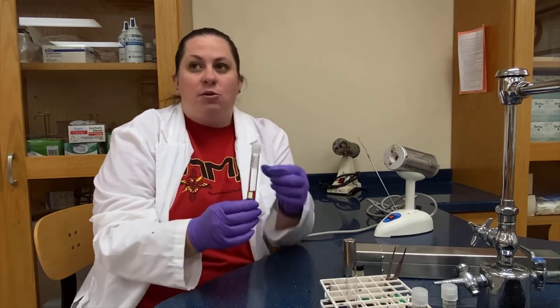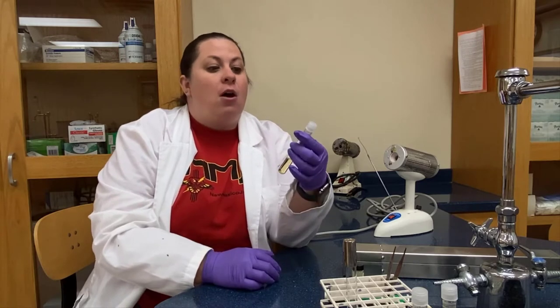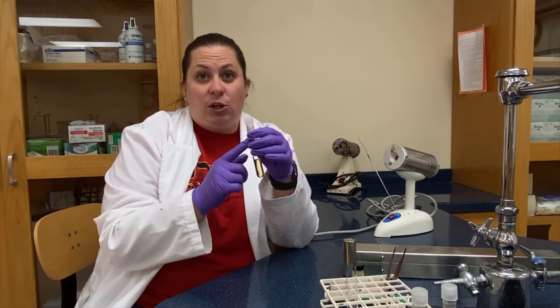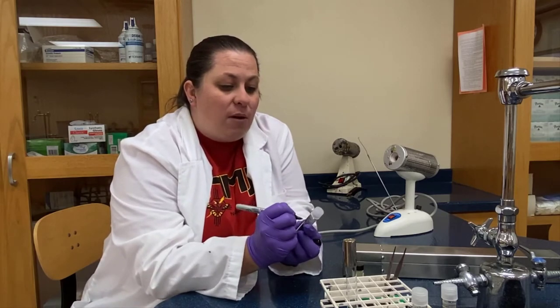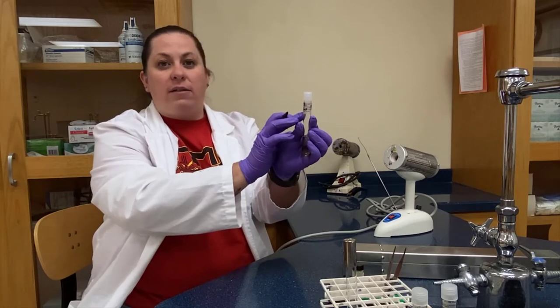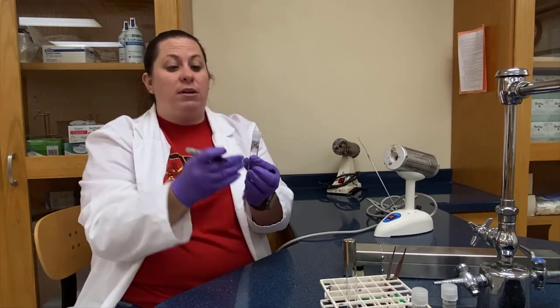Now let's talk about some aseptic techniques — what we should and shouldn't do in the lab. When we work with tubes that have either broth or agar in them, we always want to make sure we mark the tube with our initials and whatever we're putting into it. I also like students to put the date. We do this with a Sharpie — in this case I'm putting my initials and H2O and the date. Write this on the glass or on the label, but do not write it on the top lid, because if the lid gets lost or separated from the sample, we wouldn't know what sample it is.